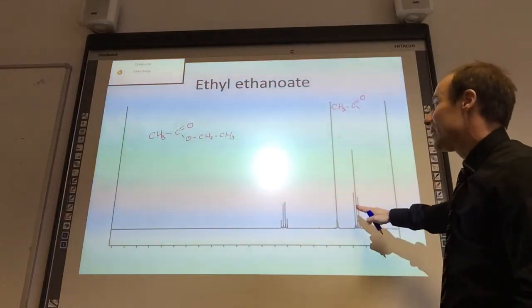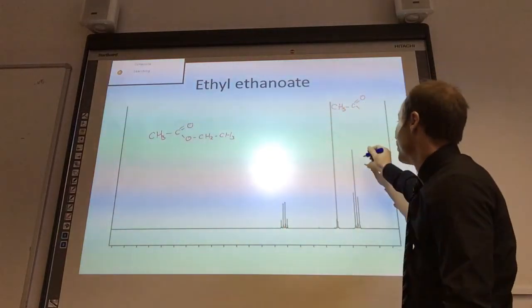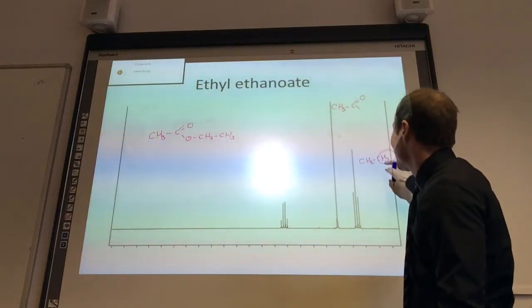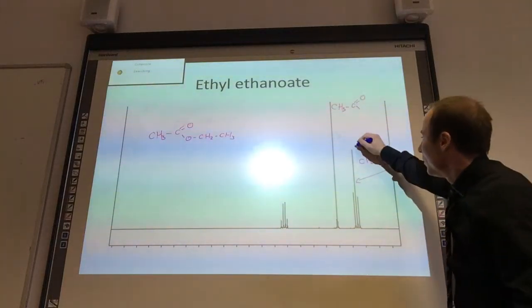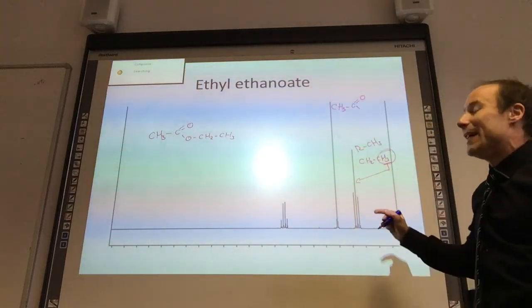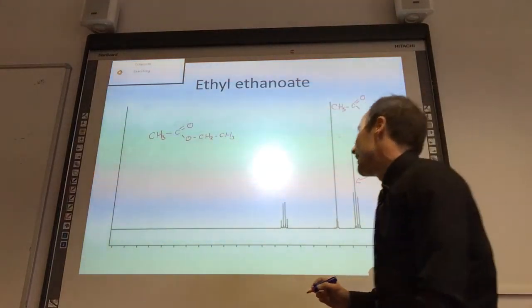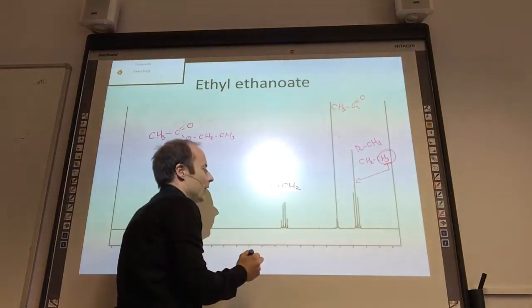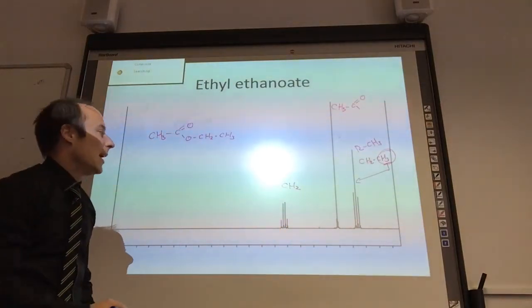What about this guy here? He is a triplet. So he is going to be a CH3 group. So he is going to be, if I put CH2, CH3, but it's that, the CH3 that's causing him. If you put our CH3, because he has got two neighbors and is then going to be split into a triplet, and then the final peak is OCH2.